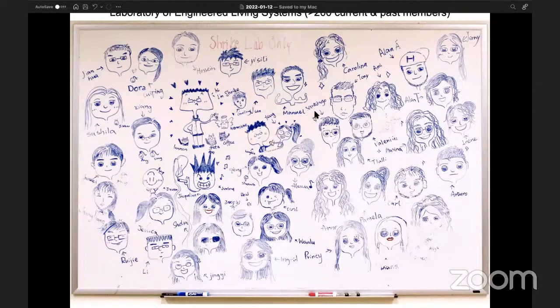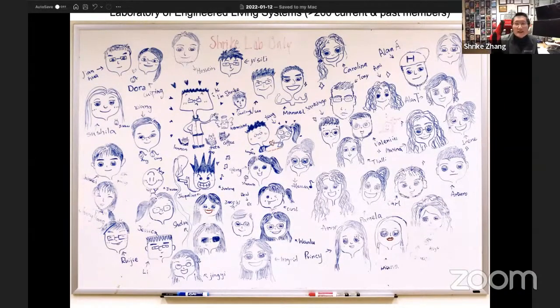Thank you. Could you stack the paper to create larger constructs? Any issues with the mass transfer of nutrients? Yes, I guess, that depends on the vascularization, right? So that's why we spend quite some efforts on creating these vascularized tissues with different bioprinting methods. Being able to really incorporate this vasculature within the tissues to allow transport of nutrients and oxygen and other things is going to be very instrumental for the survival of the cells in larger constructs.